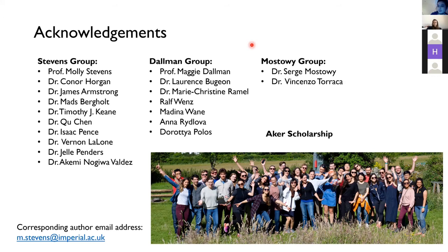In terms of correlative, I think that's a very, very interesting avenue to combine Raman imaging with fluorescent imaging.